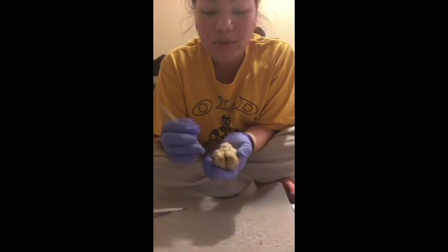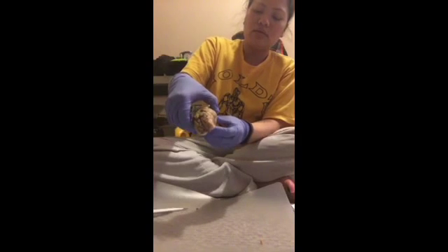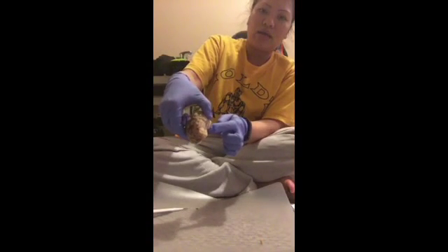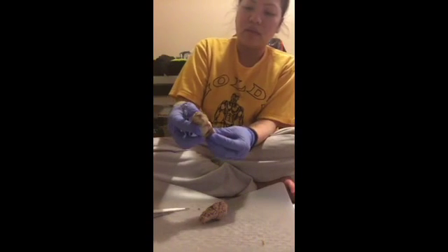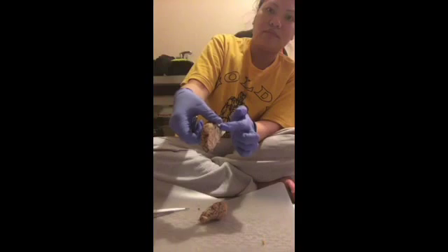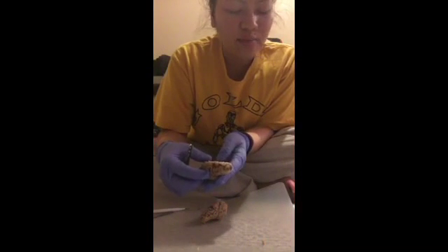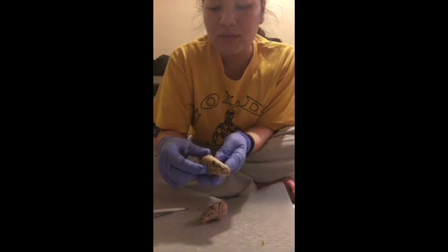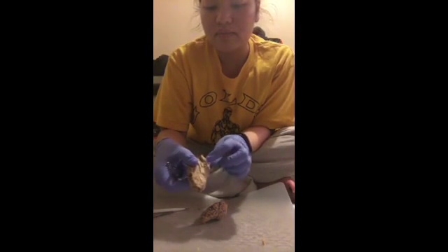And the cerebral peduncle. Okay, the cerebral peduncle, it's somewhere right here. So it's actually easier if I do it like this. It's somewhere right here. And the pituitary gland. The pituitary gland is right here. This is the pituitary gland right there.